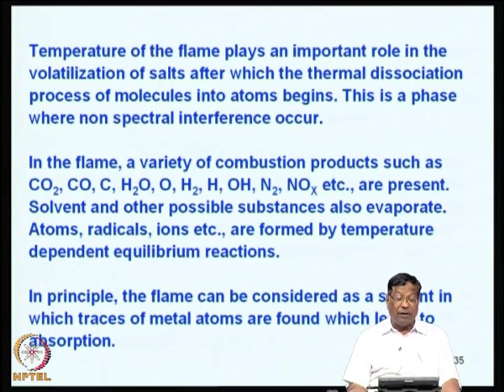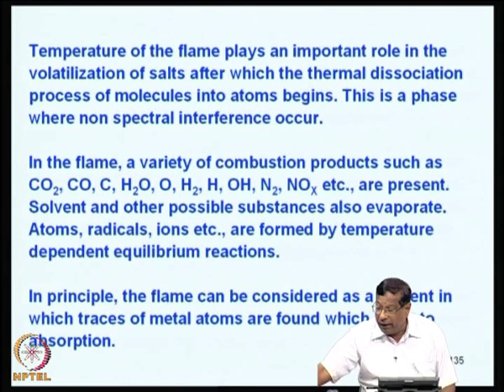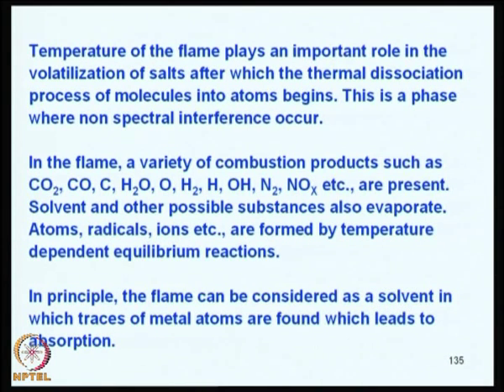So, the solvent and other possible substances also need to evaporate and decompose, forming atoms, radicals, etc. They are formed by temperature-dependent equilibrium reactions, and their presence and concentration are also governed by the residence time in the flame.